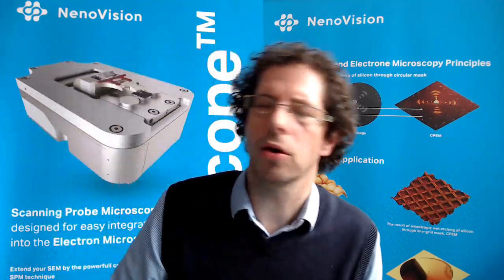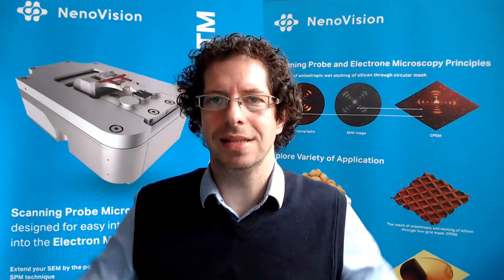And is it compatible with any SEM? The main limiting aspect of the compatibility is the size of the chamber. This is the reason why we make it smaller. To be honest, there is no other reason for limitations.